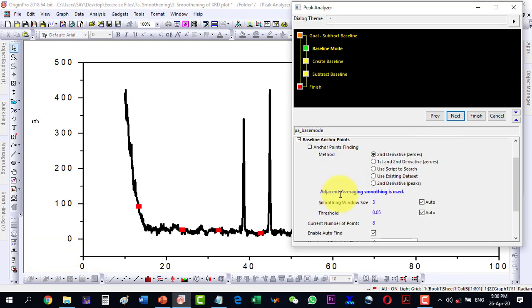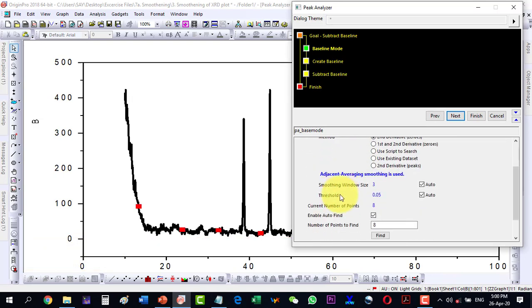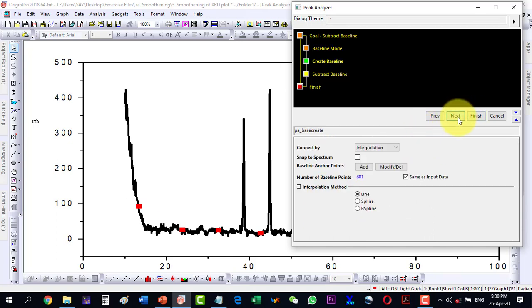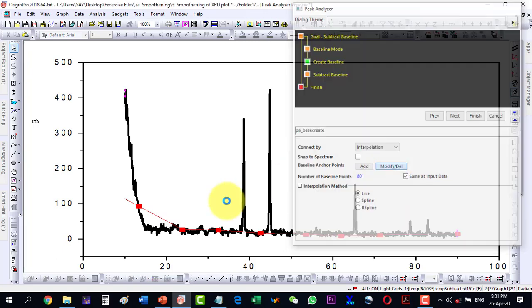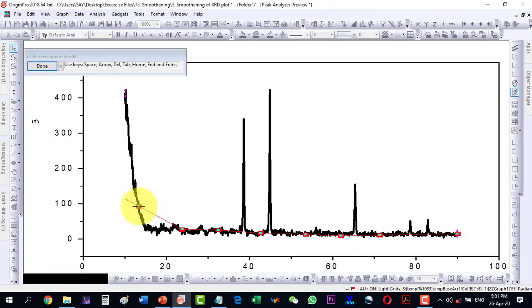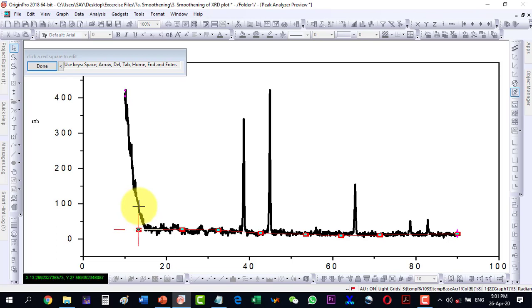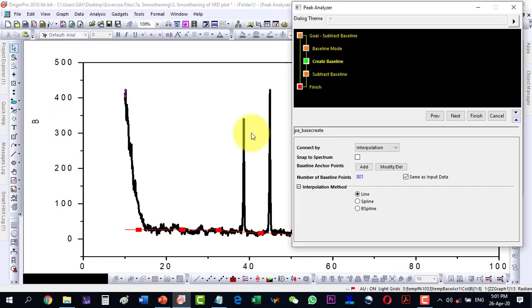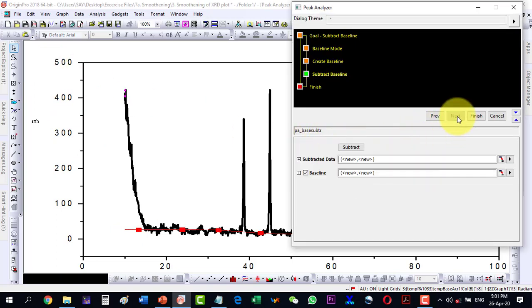And here it has found the peaks automatically and I go on with them. And next I will modify this one. Let me modify this one, it is to be here. And I click Done and then Next.